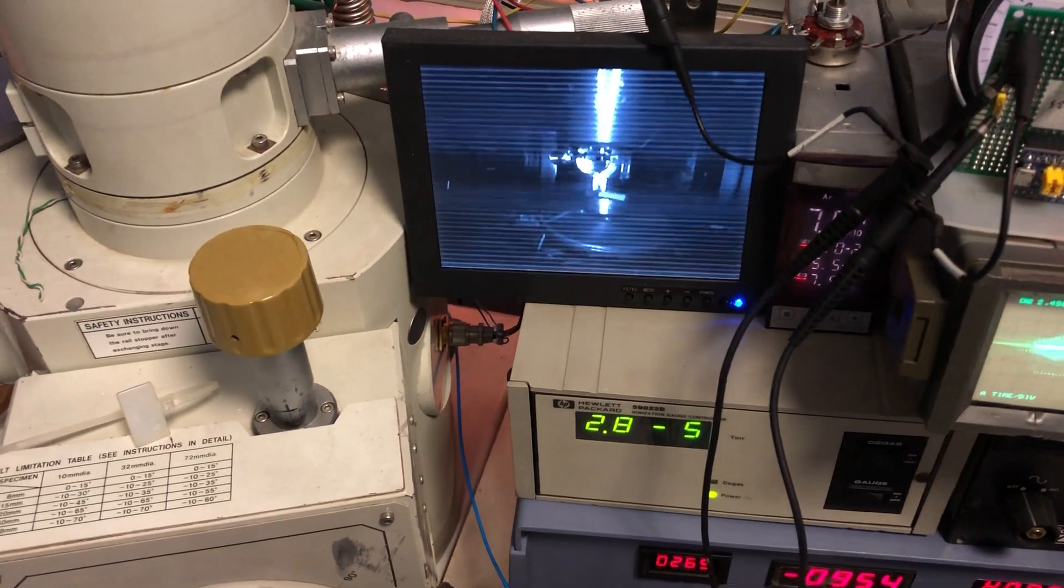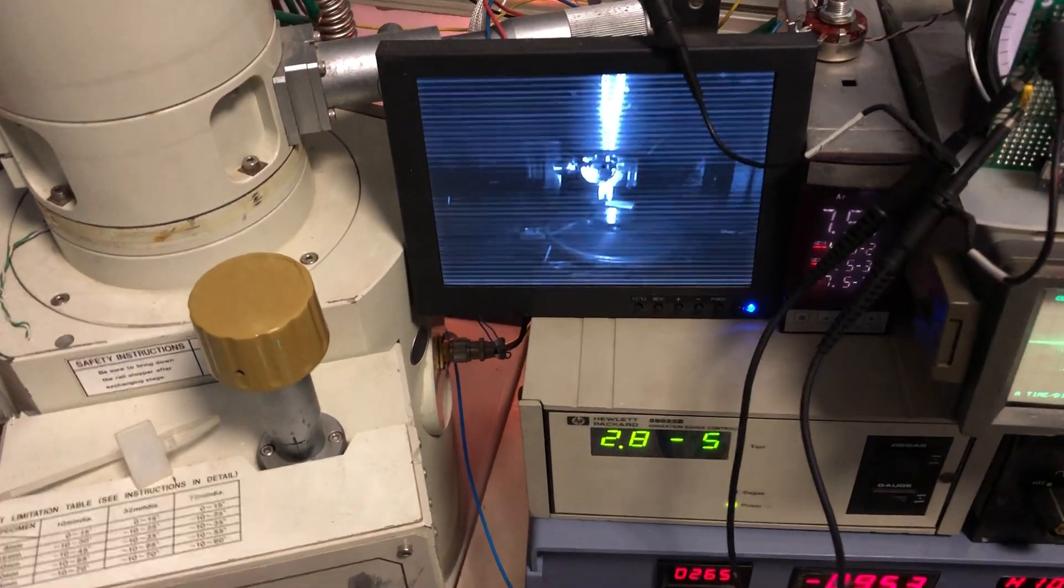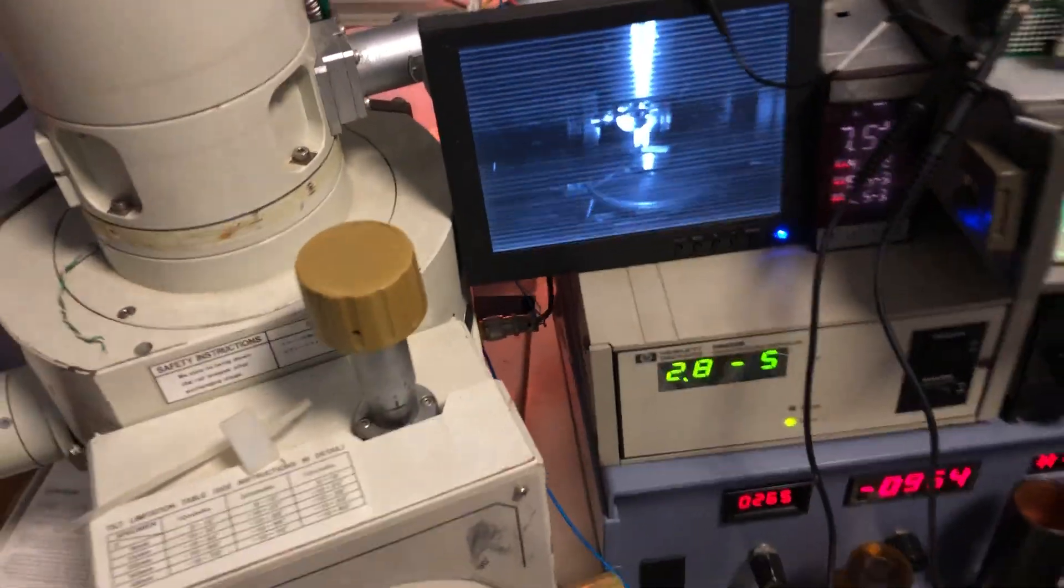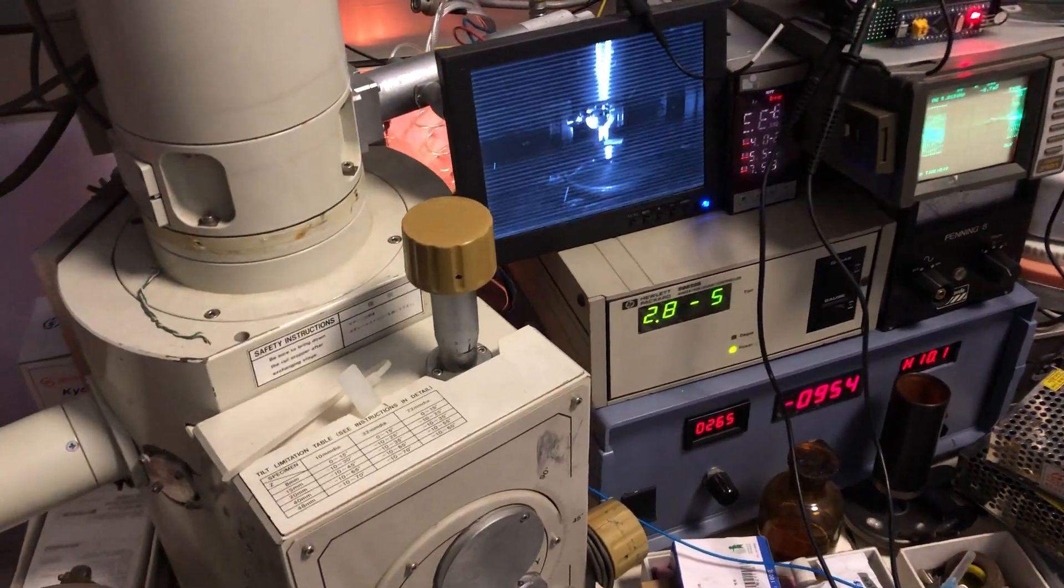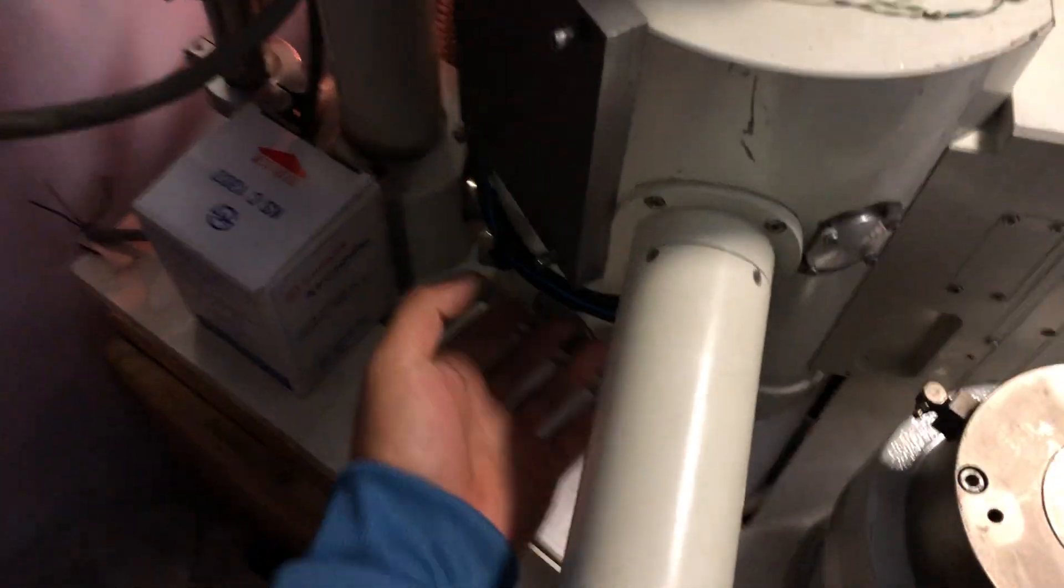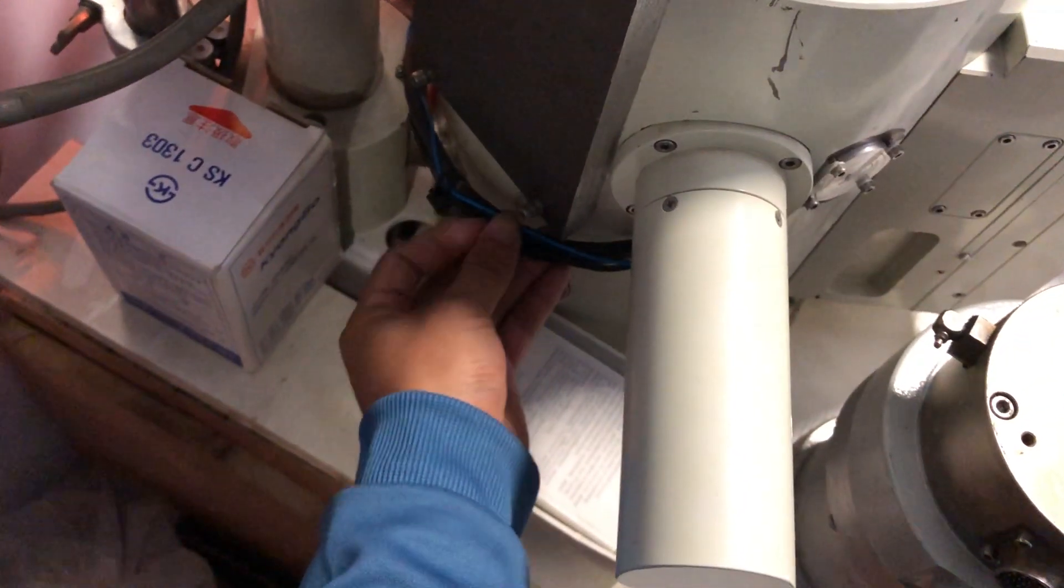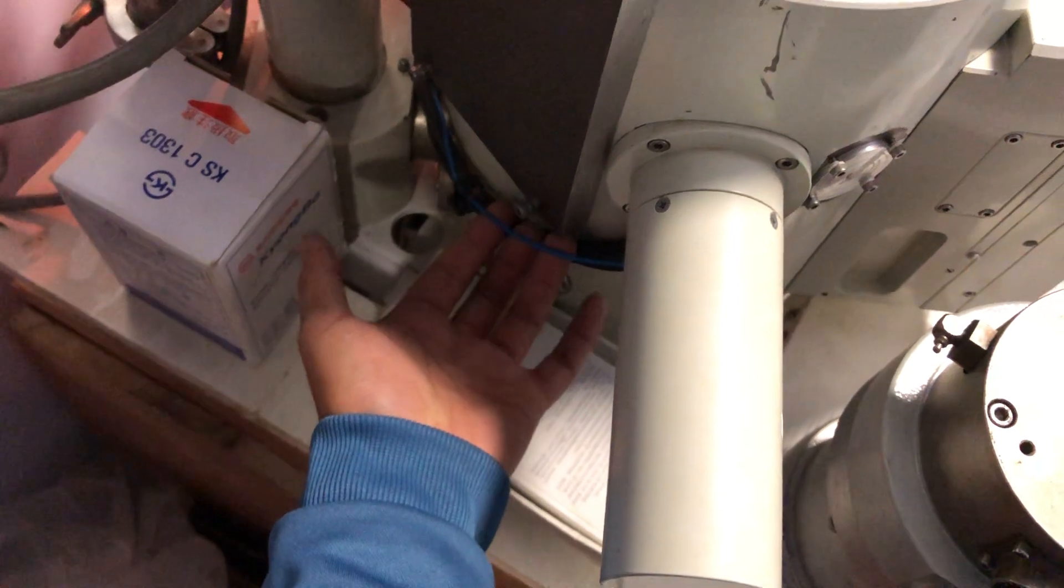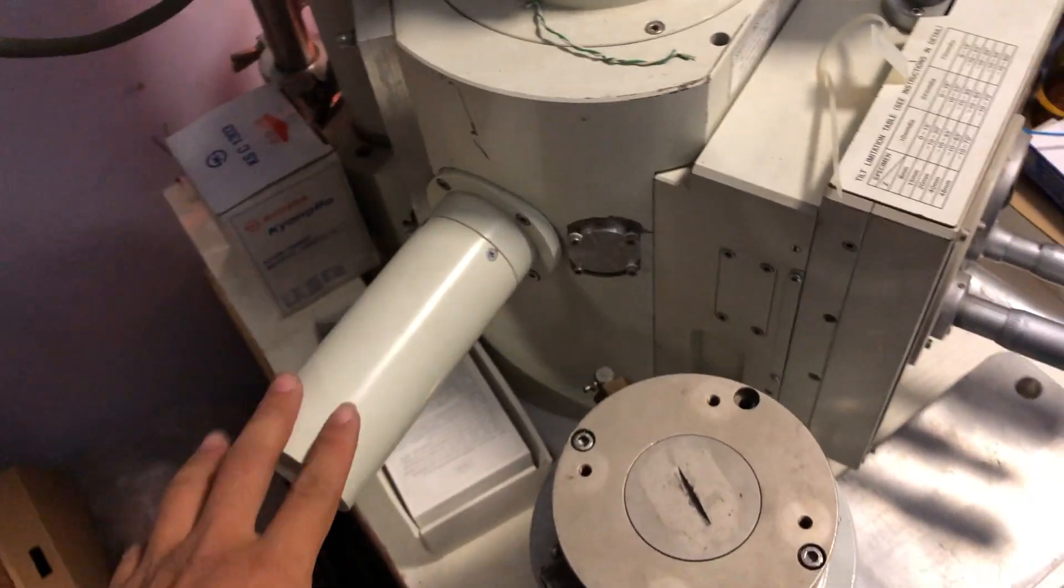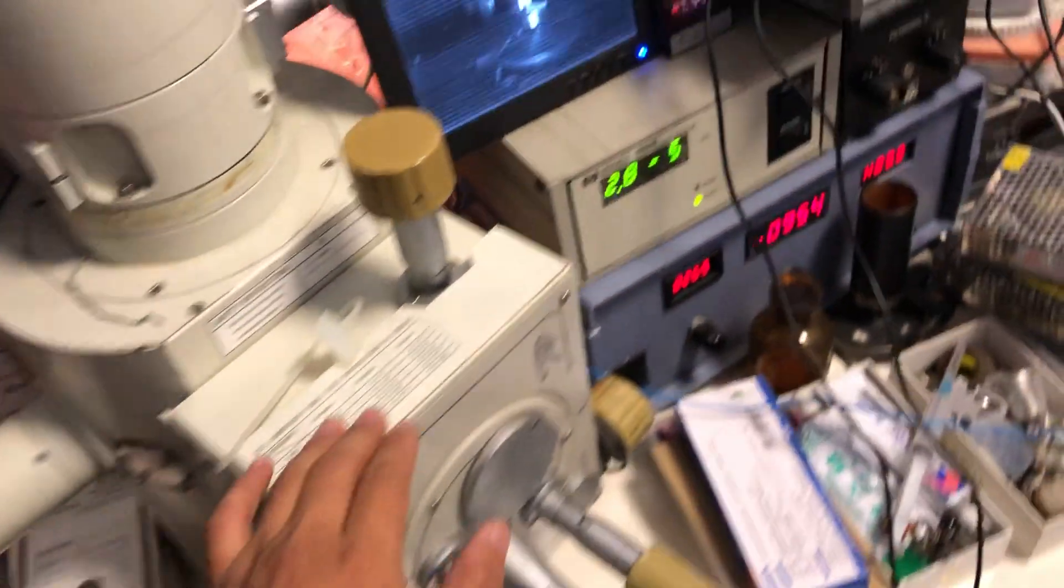Okay, I move it in so I can now join the photomultiplier with the visible light. So here is the detector itself and here is the wire. The blue wire is the signal output. It's two wire basically for the high voltage. There's no amplifier inside the detector itself.